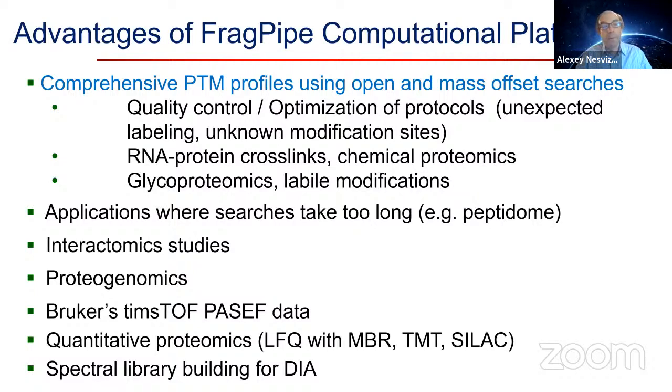But I'll focus most in my presentation on the quantitative workflows, as I mentioned, and also a little bit on the spectral library building for DIA.